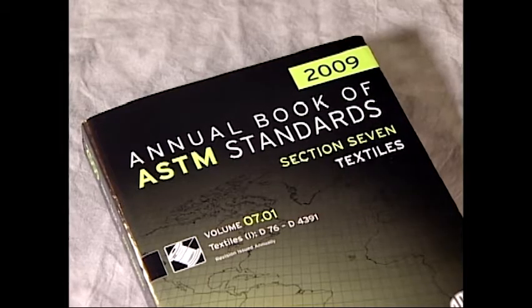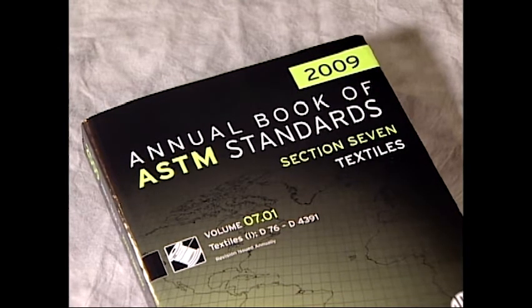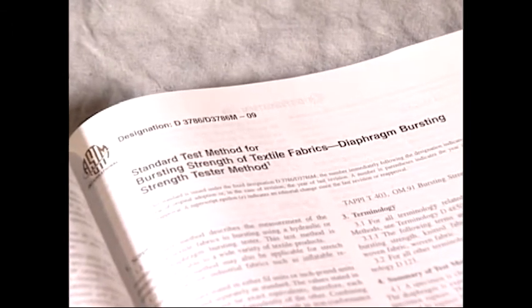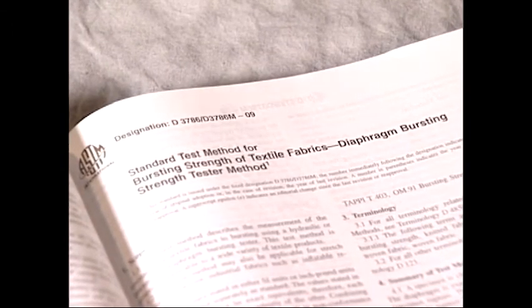The most commonly used inflated diaphragm burst test is ASTM test method D3786. It's officially known as the standard method for bursting strength of textile fabrics, diaphragm bursting strength tester method. It's acceptable for testing a wide range of knitted fabrics.